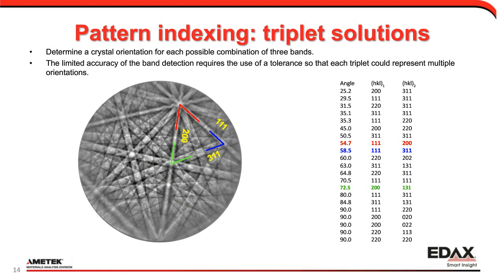Now, what I will tell you here, and this is slightly wrong in this slide of how we do things, is this is a triangle. It doesn't have to be a triangle. Just visualize it as a triangle because it's easier. We don't really use pure triangles. I don't have to have this blue guy over here to make this triangle. This could be in the left-hand upper quadrant, and that could be what I would be using for the triplet. Again, it doesn't have to be a triangle per se. So here is my solution.